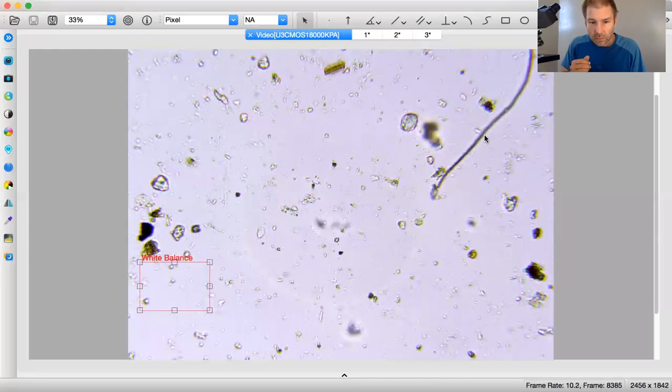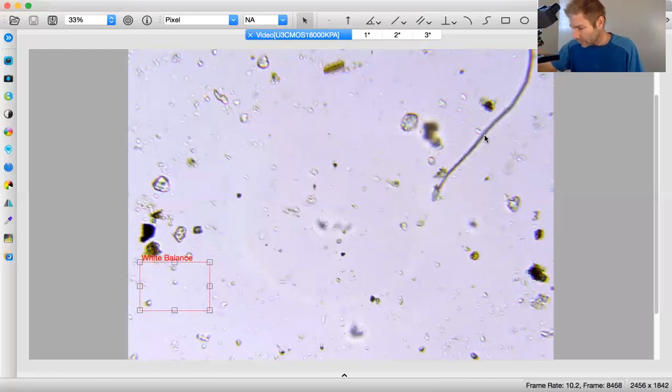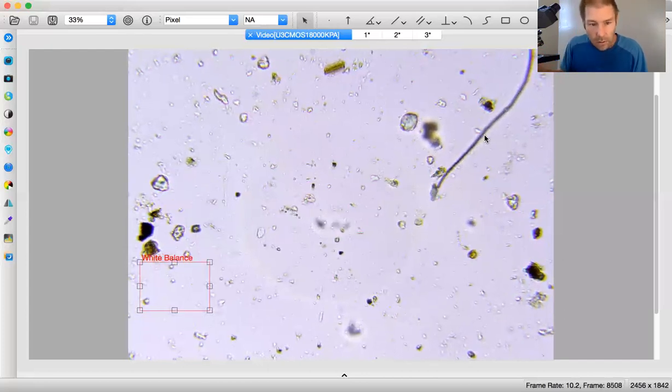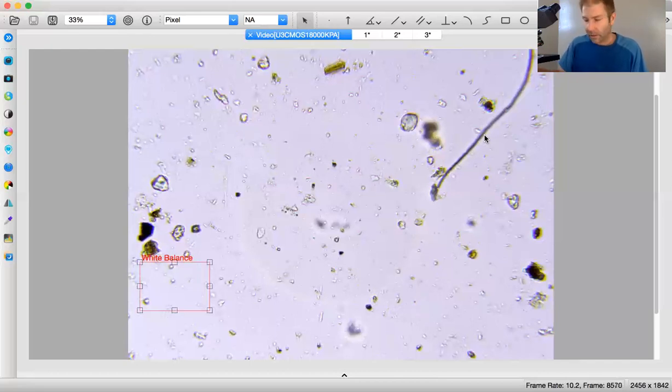So I want to say ciliate, actually, because that was fast, fluid motion. Ciliate. At least I believe it is. If I replay this, I might see something different. Okay, moving on here. Reading area number 2.